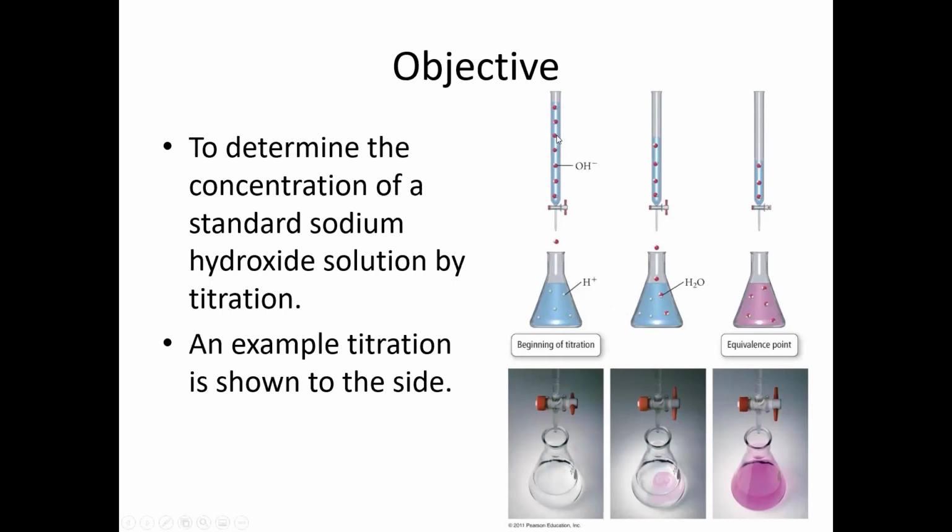Usually what happens is, once the water is in air, remember when we breathe in, breathe out, there's carbon dioxide in air, right? Carbon dioxide can be dissolved in water, and that carbon dioxide can react with sodium hydroxide. So if you weigh some sodium hydroxide and dilute it into water, the concentration is not the same as you calculated, because the sodium hydroxide will be consumed by the carbon dioxide dissolved in that water.